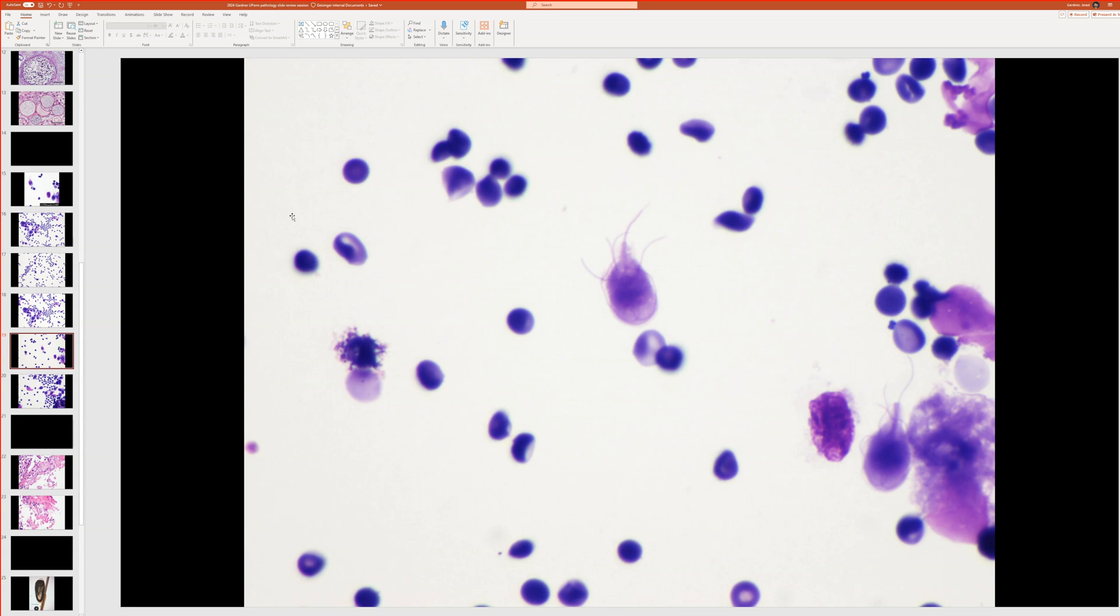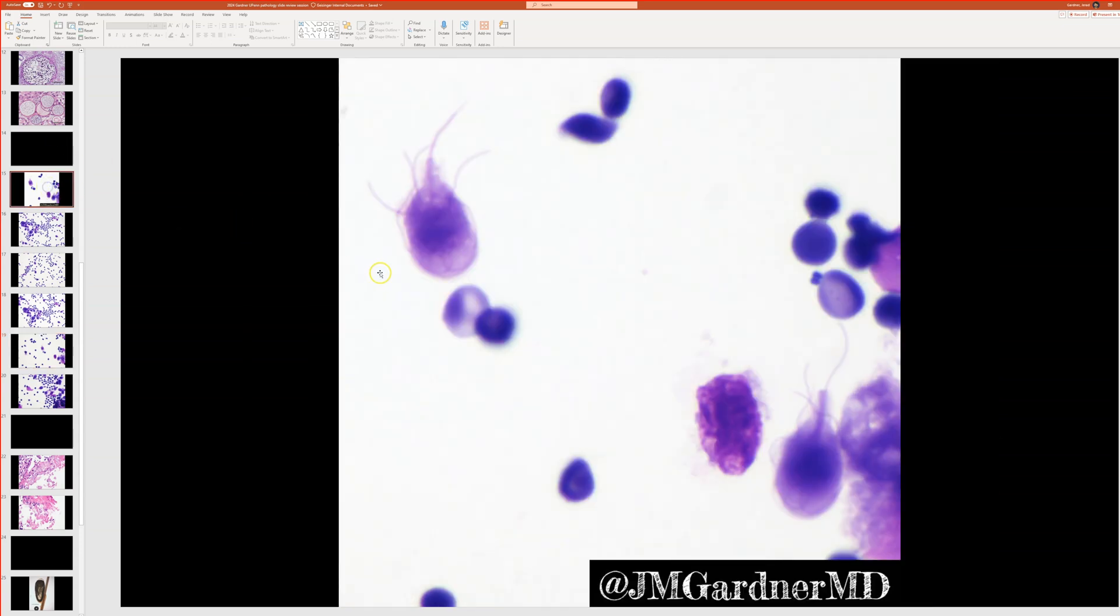So this is a cytospin. And what happened is basically a regular GI biopsy that ended up being Giardia had formalin left in it. So Dr. Balsavar took the formalin and had it spun down as a cytospin, and then it produced this incredible slide where we get to see a much nicer view of the organism.